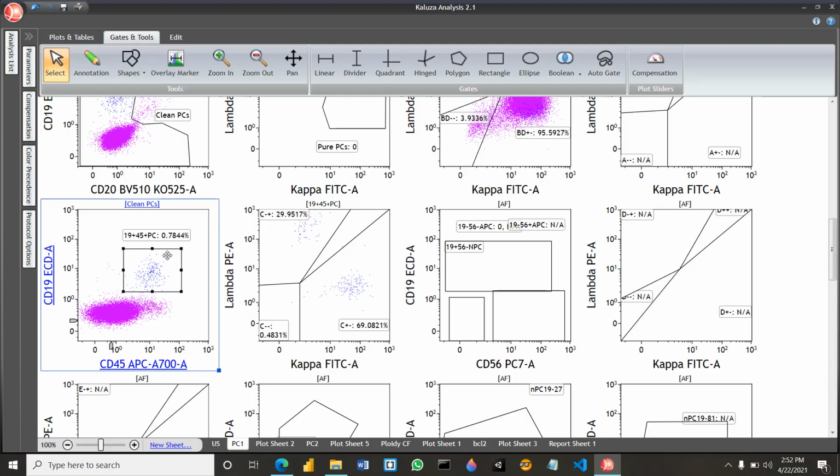So this clearly has less than 5% of plasma cells, and in fact the myeloma which has more than 5 to 10%, especially more than 10% of normal plasma cells, is called a myeloma with MGUS-like signature, and they have shown better outcome as compared to the other myeloma.